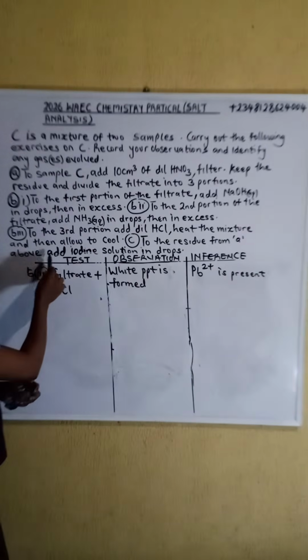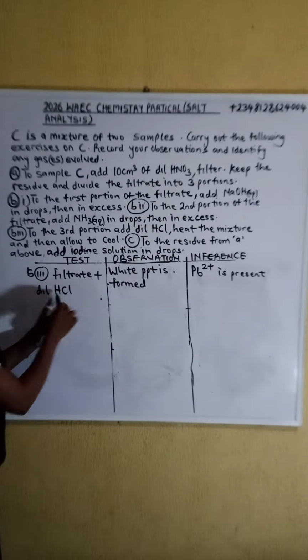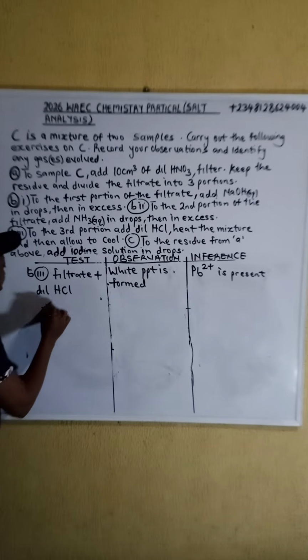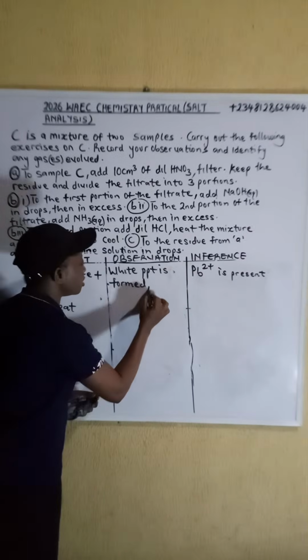Then the question says that it's the mixture after addition of dilute hydrochloric acid, then heat it. So what is going to happen on heating?